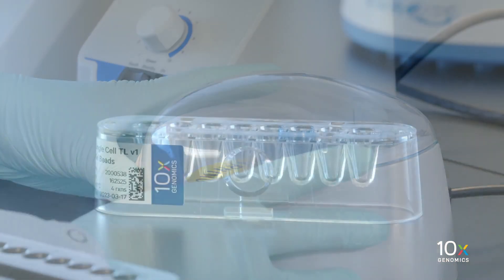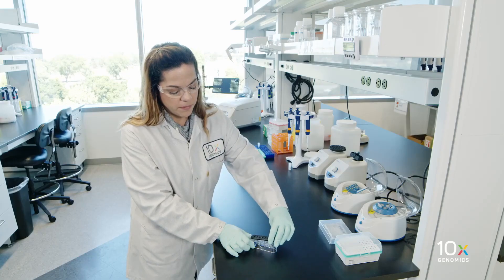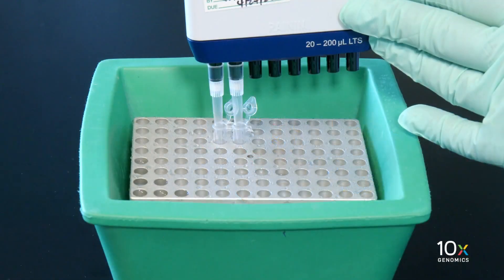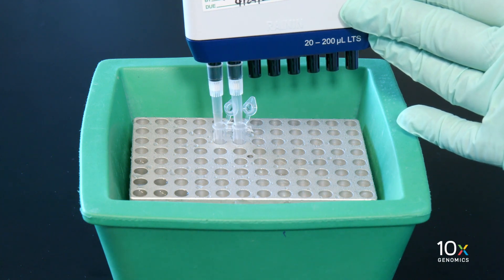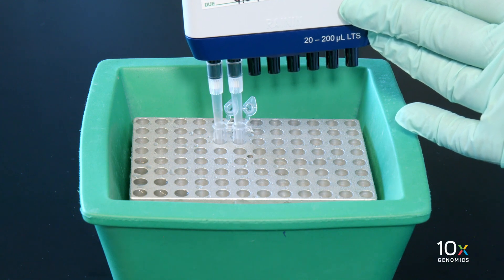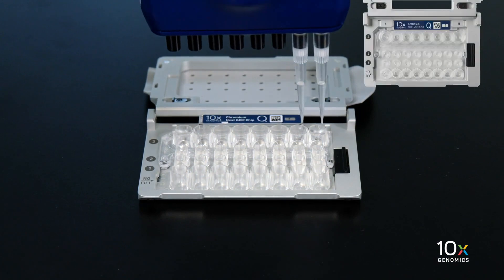Confirm there are no bubbles at the bottom of the tubes and the liquid levels are even. Place the gel bead strip back in the holder and secure the holder lid. With the pipette set to 70 microliters, gently pipette mix the GEM master mix and sample 15 times. Using the same pipette tips, dispense 70 microliters into the bottom center of the wells in the row labeled 1 without introducing bubbles.